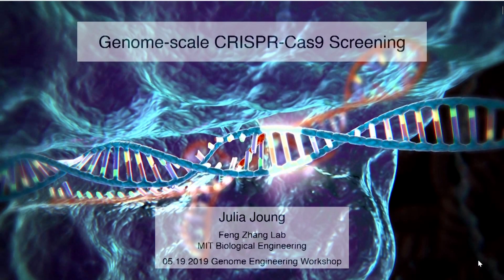Hi, good afternoon, everybody. So today I'd like to give an overview about how to perform and design CRISPR screens. And this is an overview about what we've published a few years ago, the details on how to perform a CRISPR screen in a Nature Protocols paper from 2017. So today I would like to just give you the overall highlights of what's important when designing and performing a CRISPR screen, as well as any updates we've had to the protocol since the publication.